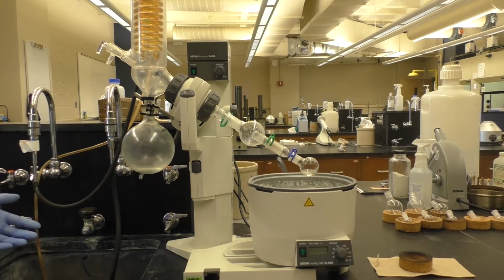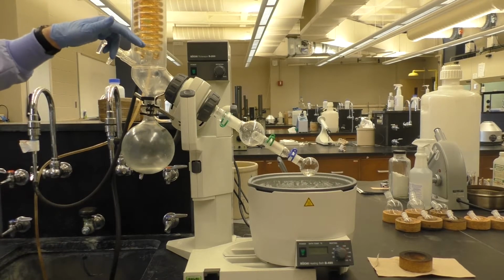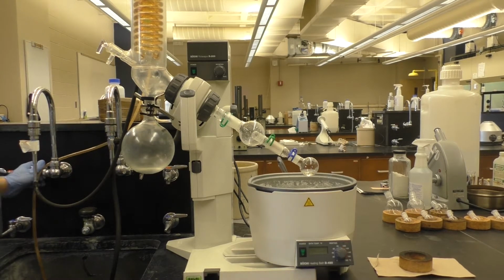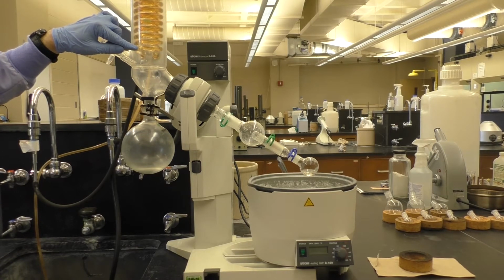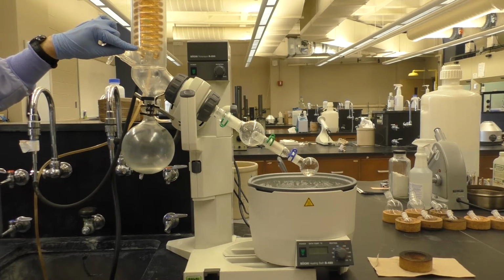Now, I will turn on the water chiller, the chilling water here, which is just sink water, until I have a reasonable flow rate for the chiller water. Not too fast, and you may not be able to see anything at all on the camera, but we have essentially water now flowing through these chiller coils.